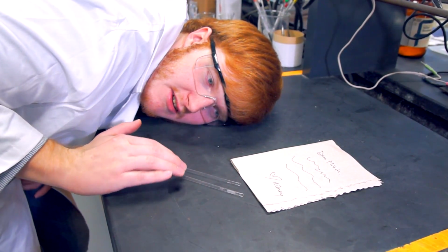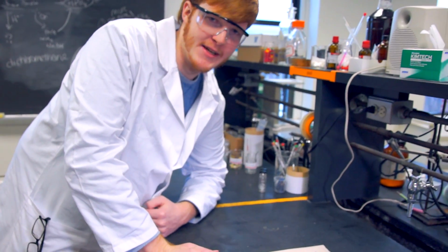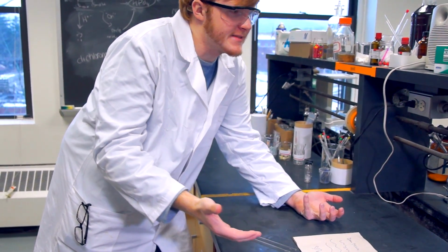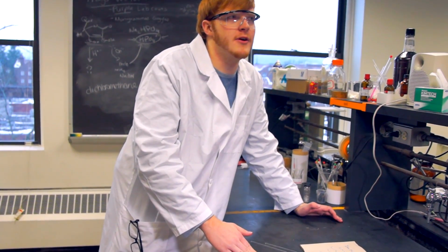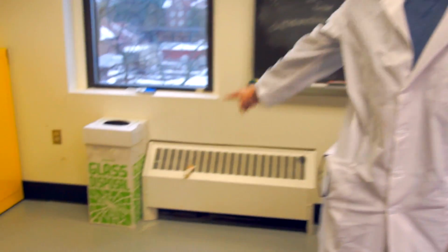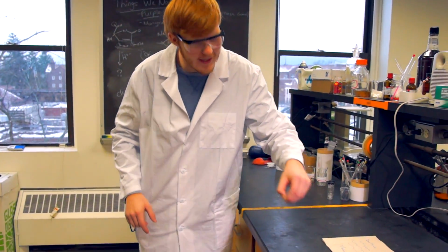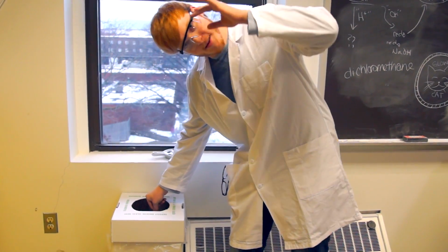It'll be all right. Really messed up this time. What do I even do with these? Where do I dispose these? Place it in the glass disposal, Mitch. I don't know where that is. Look behind you. Oh, hey. There it is. I should take these guys and put them in here.